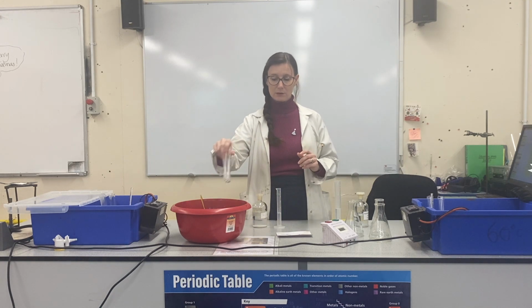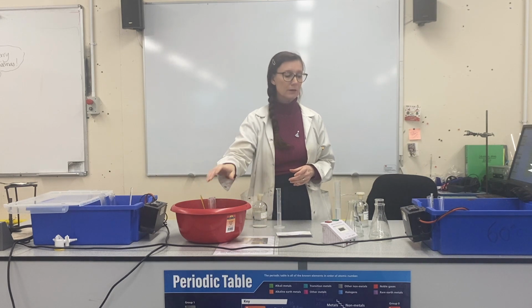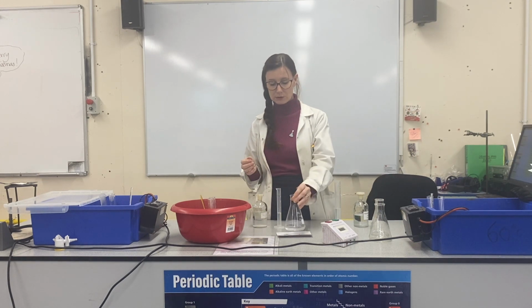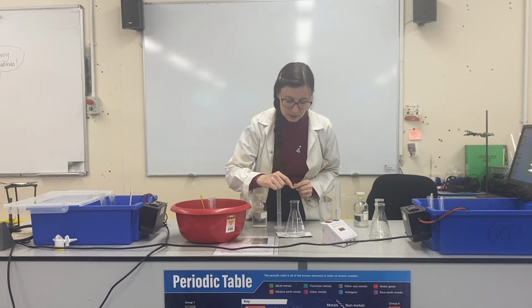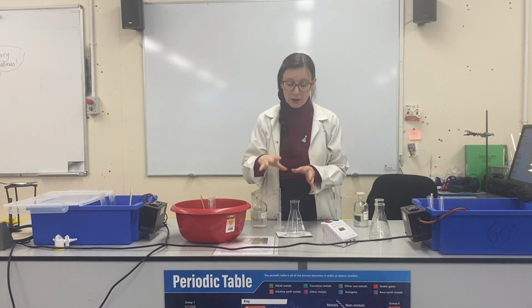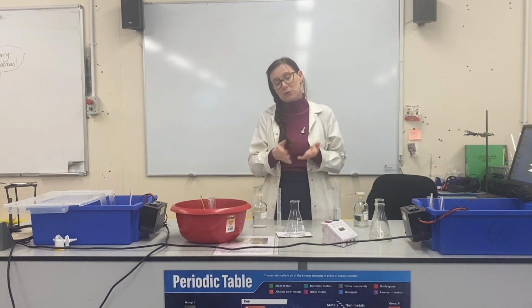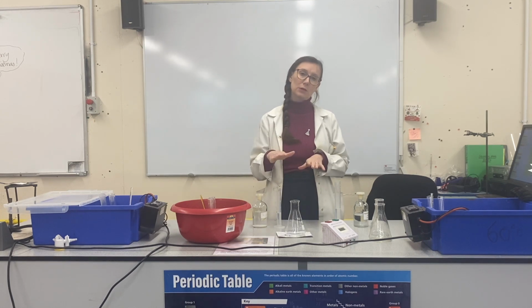I'm going to put the reactants into 2 separate boiling tubes in the water bath and leave them until they get to the temperature that we need. Then once they're at temperature, put them into the conical flask, which will be stood on the cross, pour them in, start the timer, and as soon as I can't see the cross anymore, we stop the timer and record the time. So here we're recording how quickly our product is being produced, because it's the product that makes it go cloudy. We get a precipitate in our solution which obscures the cross.